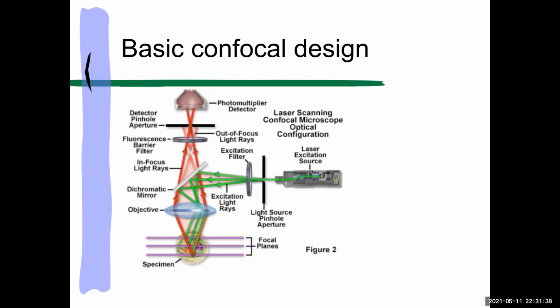We used to swing different holes in front. Now they have an aperture that is controllable and you can just dial in the size, but it's literally that. It's just a hole, a pinhole in the right place, the same as the old pinhole cameras and so on. It's just knowing your physics and figuring out the design of this that made confocals possible. And the design has been around since the 1940s, I think.